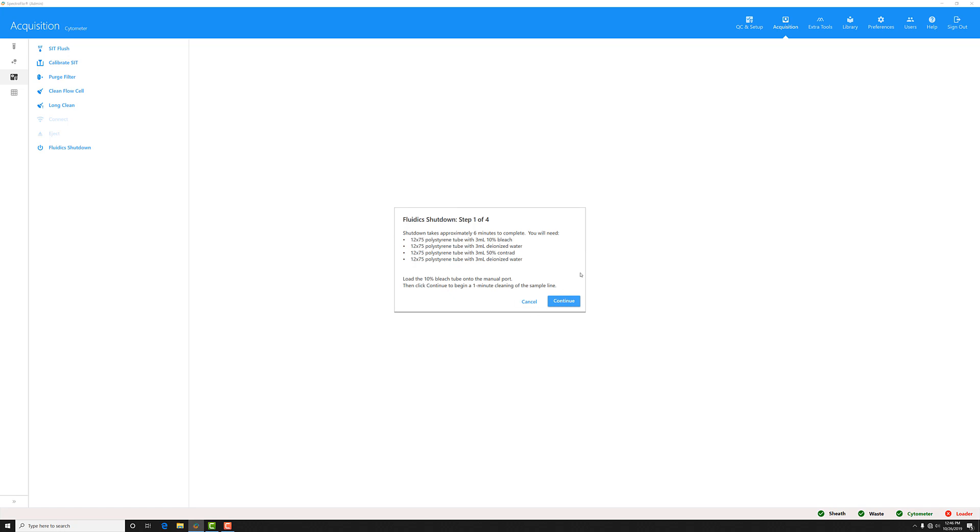In SpectreFlow version 2.2, we changed this routine so you now are asked to run four tubes at shutdown instead of the previous two tubes. This is because we realized shutting down with four tubes does a much better job of cleaning out the flow cell so that you have a clean place to begin the next day.